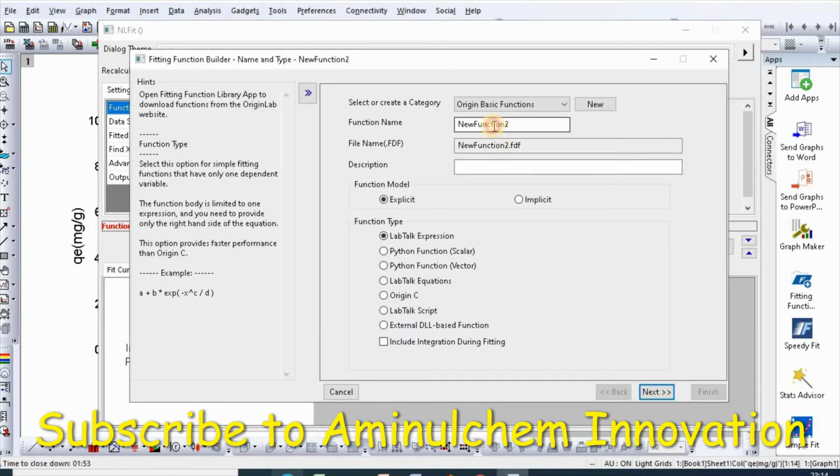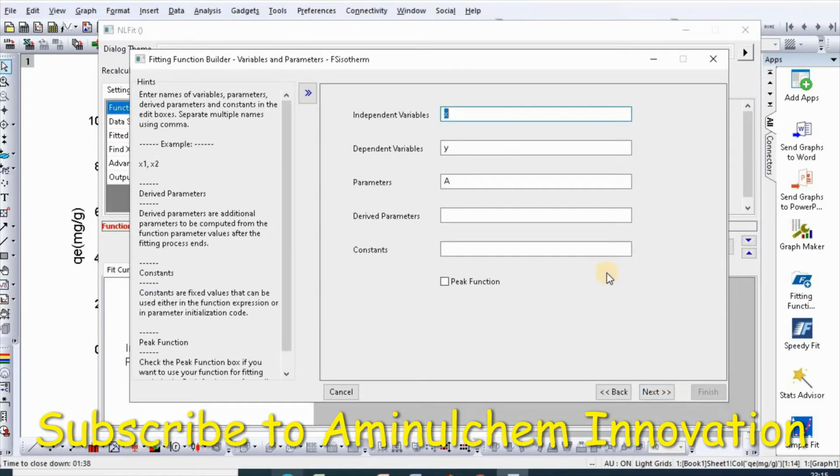click on New, then rename it, for example, FS isotherm model. Then click on Next. The independent variable is CE, the dependent variable is QE, and the parameters are A, B, M and N, 4 parameters.